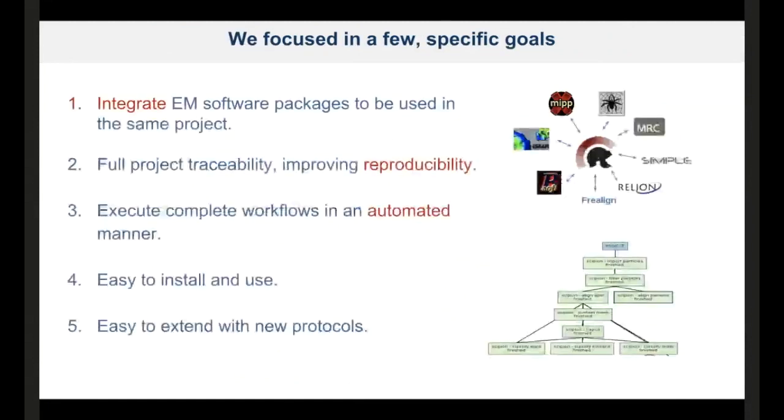We try to improve all these problems. So when we started this project, we tried to focus on very specific goals, because in software development, it's quite easy to get distracted by technology and very shiny new frameworks that can distract you from the main goal. So we said, okay, the first thing we try to solve is integration. We want a researcher to be able to use many software packages in a smooth way to complete the whole processing pipeline.